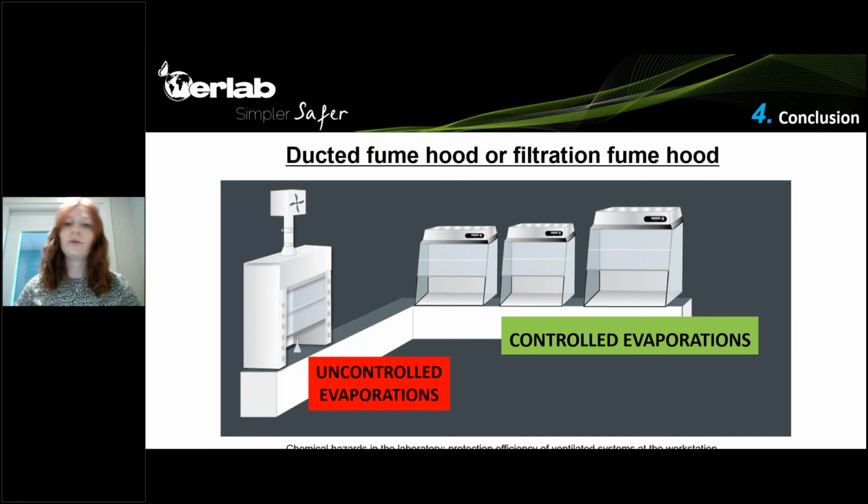The ducted fume hoods should be used for all the uncontrolled evaporation, that is, the evaporations that we don't know about, like when chemists are not able to give a precise description of what is going to be done inside the laboratory. And ductless fume hoods should be used for everything that can be controlled, so everything that can be described by the user beforehand, at the beginning of the process of buying the fume hood.